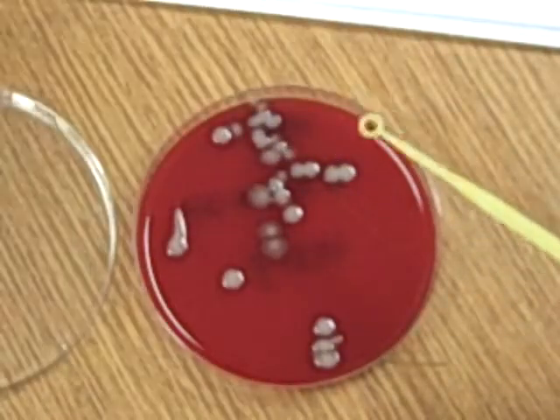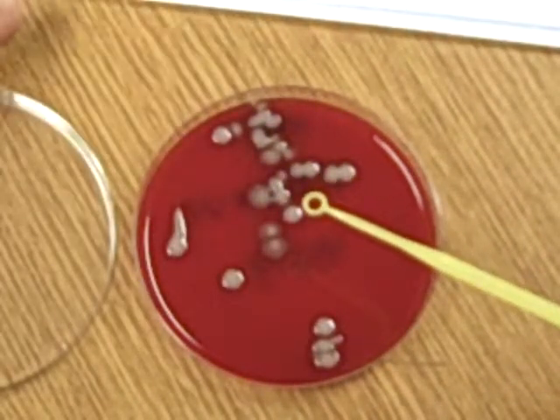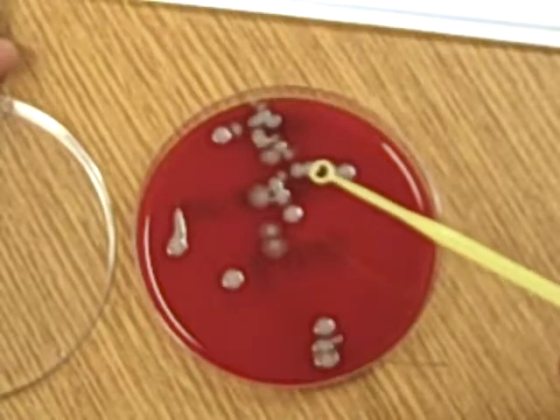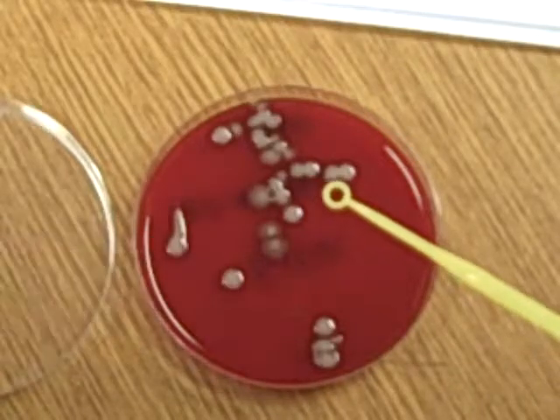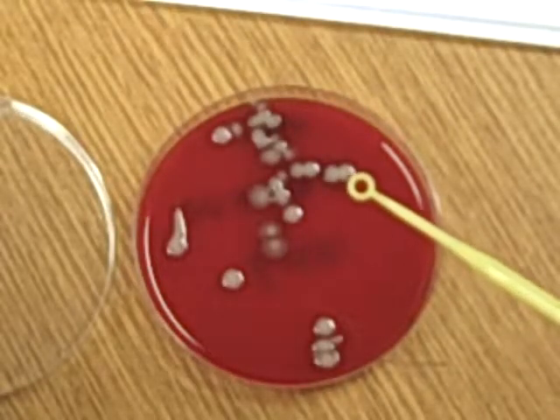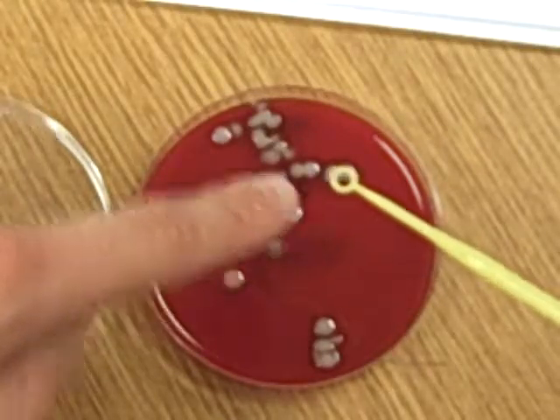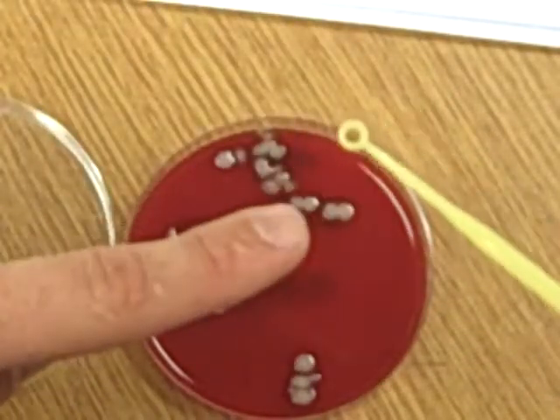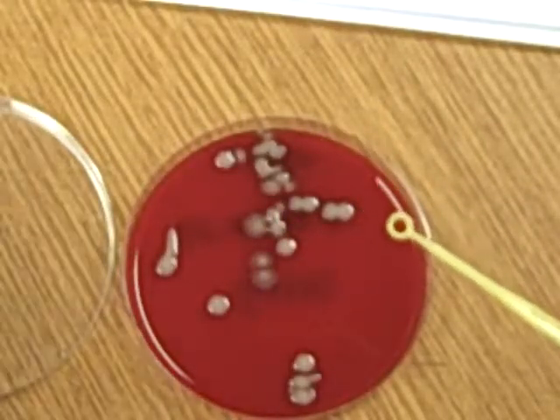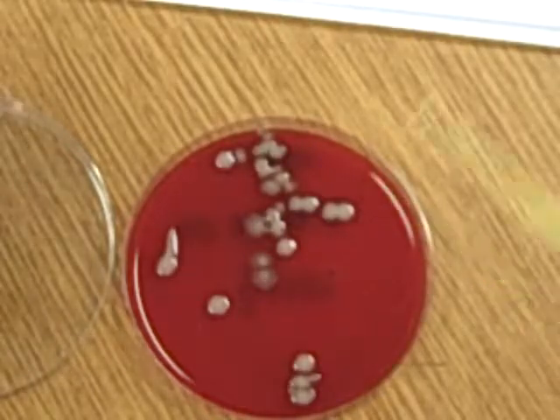So what I'm doing is I'm converting from the microliter loop to a number of colony forming units per milliliter. So if I'm using a 10 microliter loop, essentially that's the same as a 0.01 milliliter loop. So every colony forming unit, or every organism that grows from me streaking it out with this loop, is representative of 100 colony forming units.